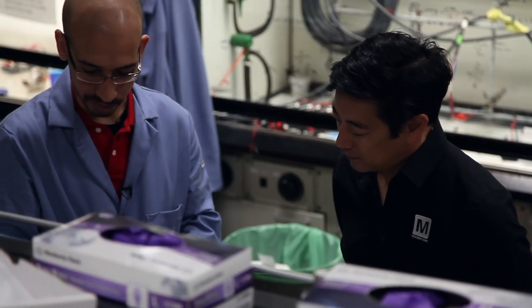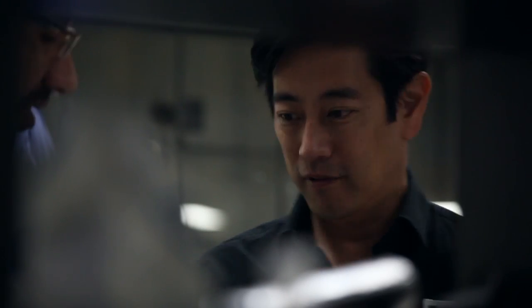The next step is just to dry this up — you can just put it in an oven. How long will that take? About 30 minutes. Okay, let's do it.